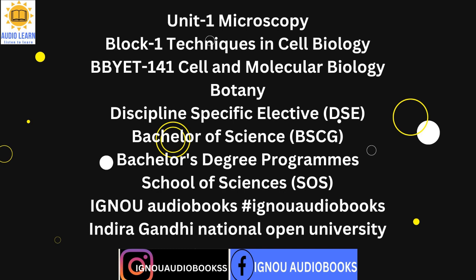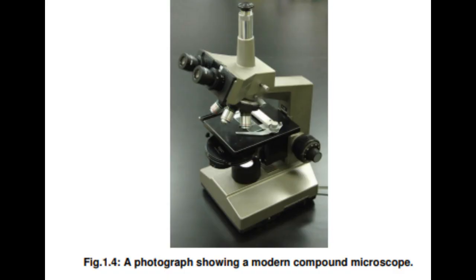Simple light microscope. A microscope having one lens is called a simple microscope. This type of microscope can magnify an image up to 300x. It has low magnification as it uses a single lens. The resolution power of a simple microscope is below 1 µm.